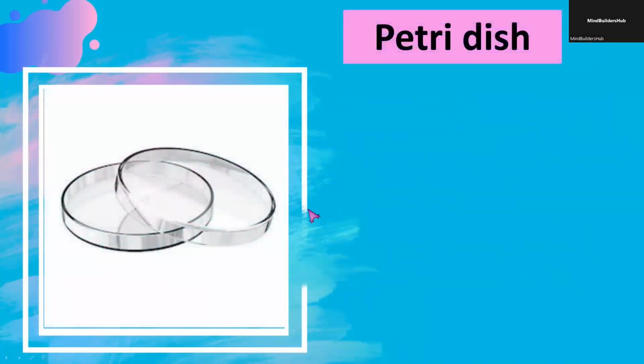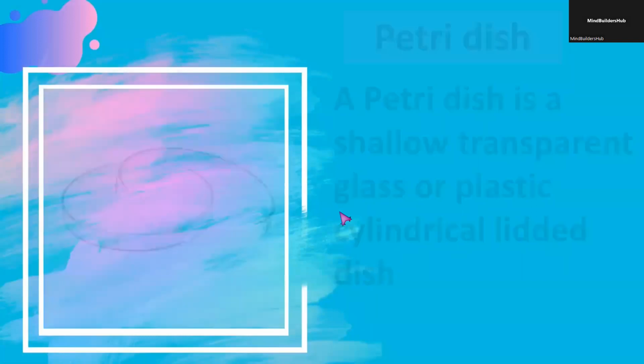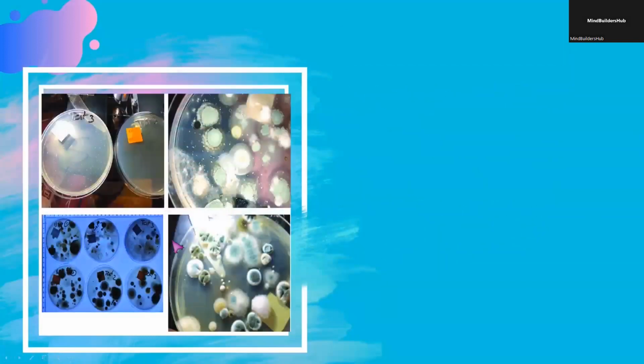Another is a Petri dish. You look at this one, it is a transparent glass or plastic cylindrical lidded dish. It is used whenever you are culturing something like bacteria like this. You have to cover it with a glass also for easy observation.